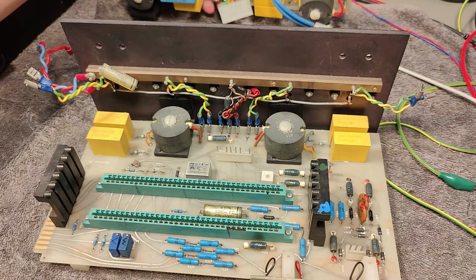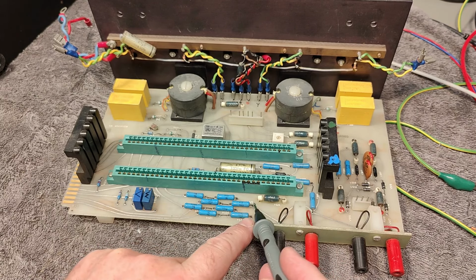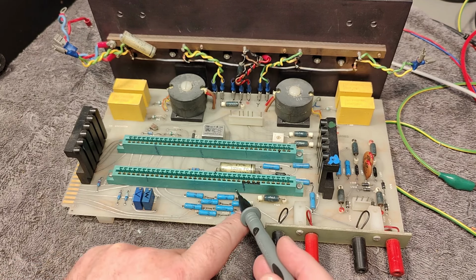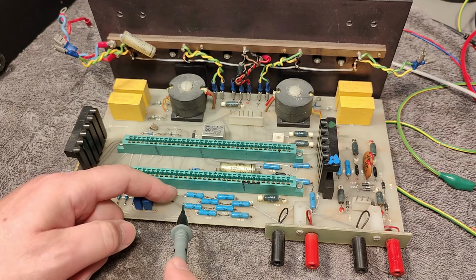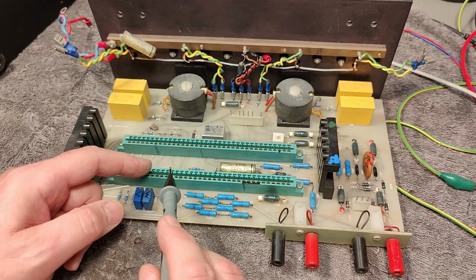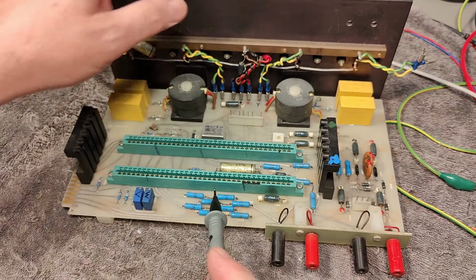All right, so now the fun thing, this is also why they're using all those resistors. Everything is balanced, so funny enough, they divide the output voltage with half of those, and this becomes the voltmeter, and the other half of those resistors become, again, a balanced measurement, a positive and a negative voltage input to the opamps here. And that is why they are using that crazy amount of opamps for everything, because everything is completely balanced, positive and negative. So that is a little bit funny.